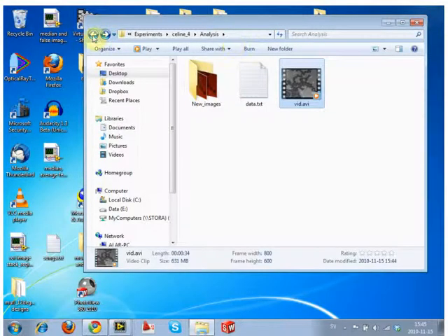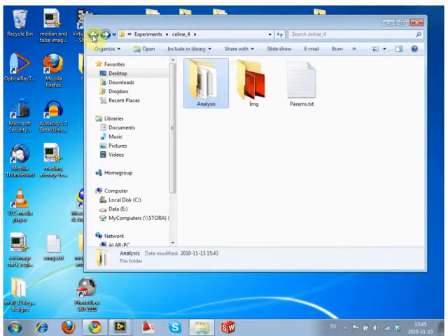We're running the same program? Maybe the same, but maybe not. Oh, you've got a different image set. Oh yeah, no, so I can show you where the error is.